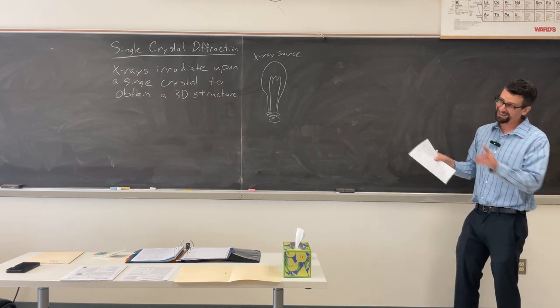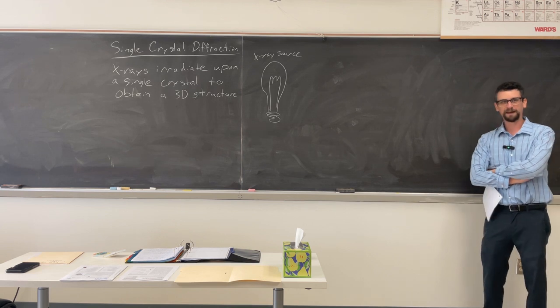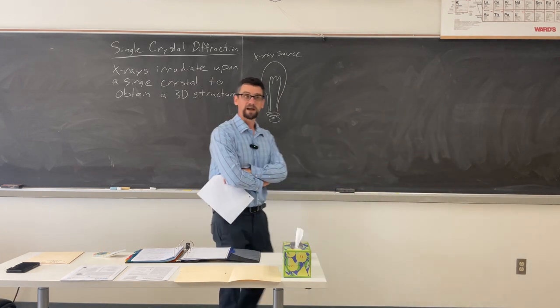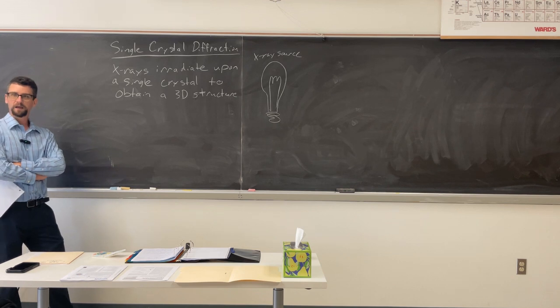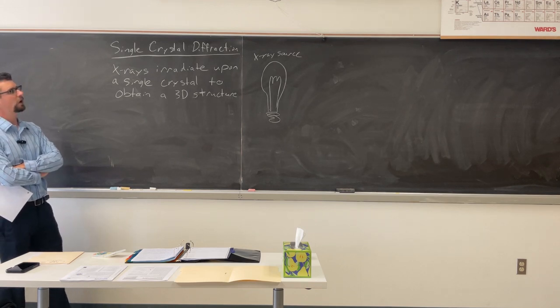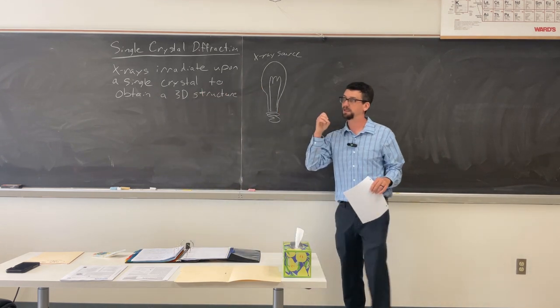You could do that. That would be really hard to control the quality of, so we don't really do that. Yeah, you have an X-ray tube where you generate X-rays from discharge, so that's a possibility. You don't want to swallow just radium. You're going to have a bad time. So you have these discharge tubes. That's the main source of the ones used in medical devices that hit you with X-rays.